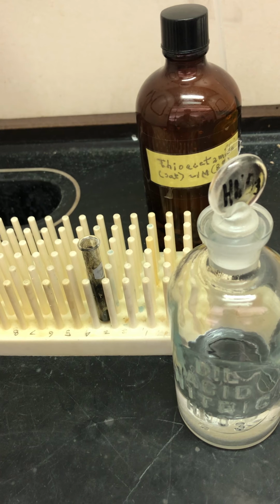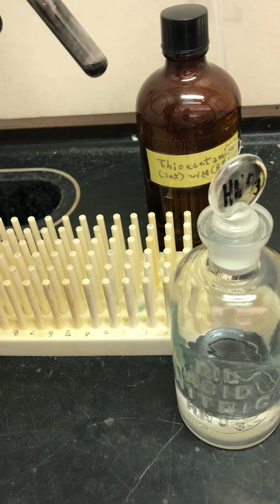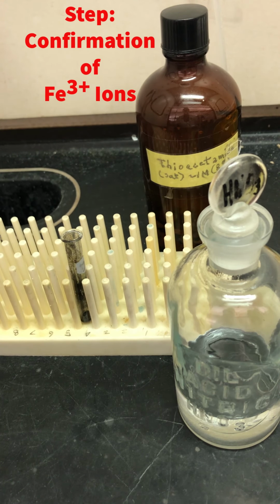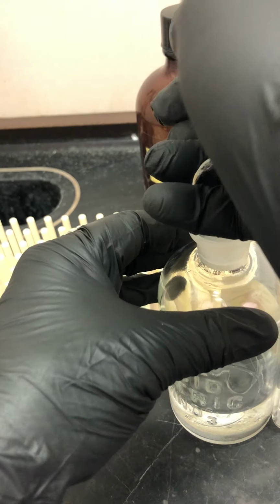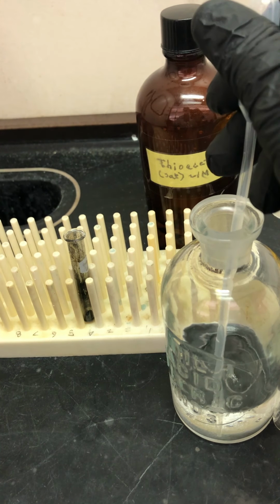Okay, students, I'm back in the fume hood. I have my pellet that should have my iron 3 sulfide precipitate. And what I'm going to do now is redissolve it in nitric acid. This is dilute or 6 molar nitric acid. And again, as before, the same thing I did with the copper one. We're going to redissolve our iron pellet.